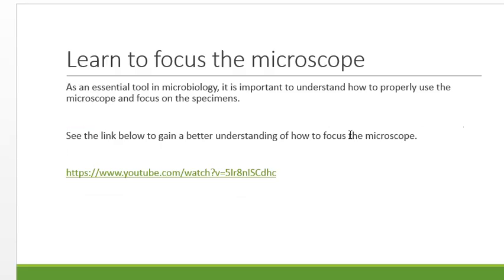Now, not being in lab, you still need to understand how you go through that process of focusing the microscope. So here's a good video. The link is also found in D2L in the week 2 module, but review it. That'll help you get a better understanding of the microscope, in particular on how we go about focusing it. So that's the third and final of the videos for week 2.